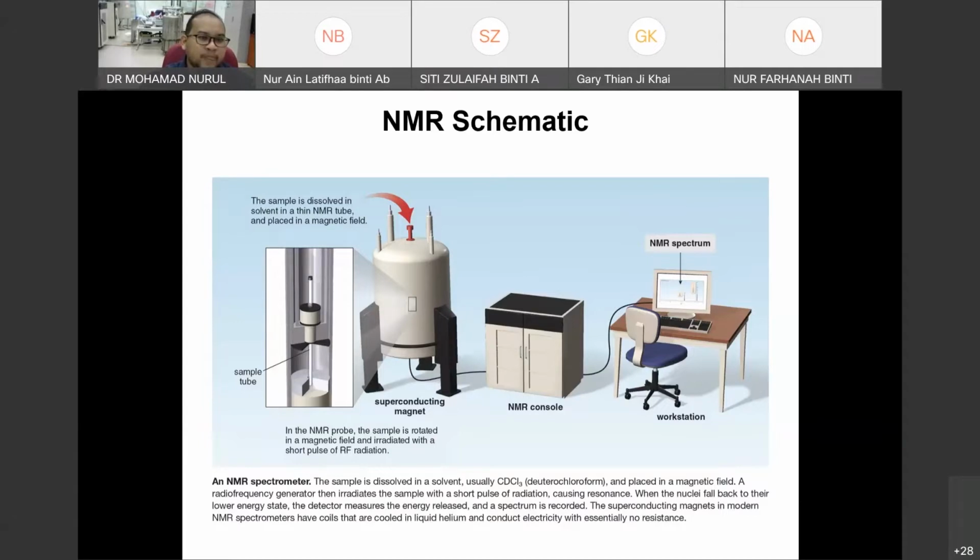And next to us, in chemistry, we actually had 300 megahertz at the back, and 400 megahertz for solids after converting from liquid to solids. Now we already have to shut them down because we don't have enough budget to maintain them. The only one left is the 500 megahertz liquid. By next year we won't have any spare parts, so we have to buy a new unit soon.